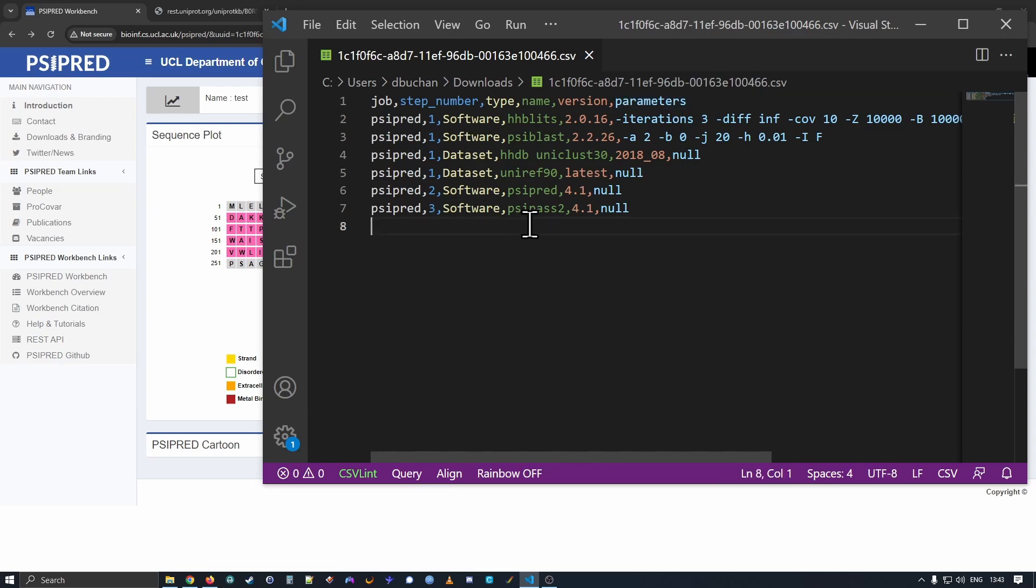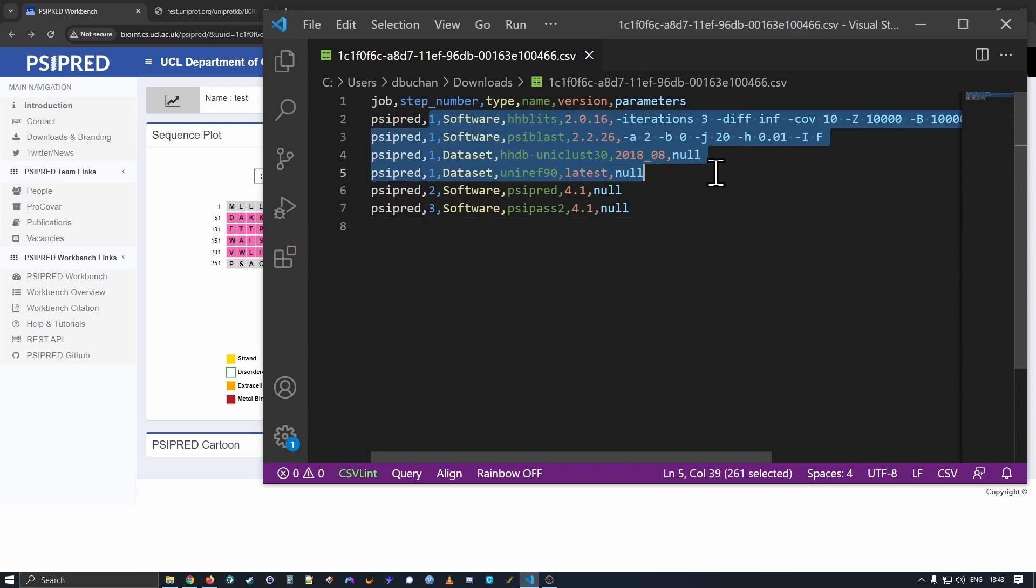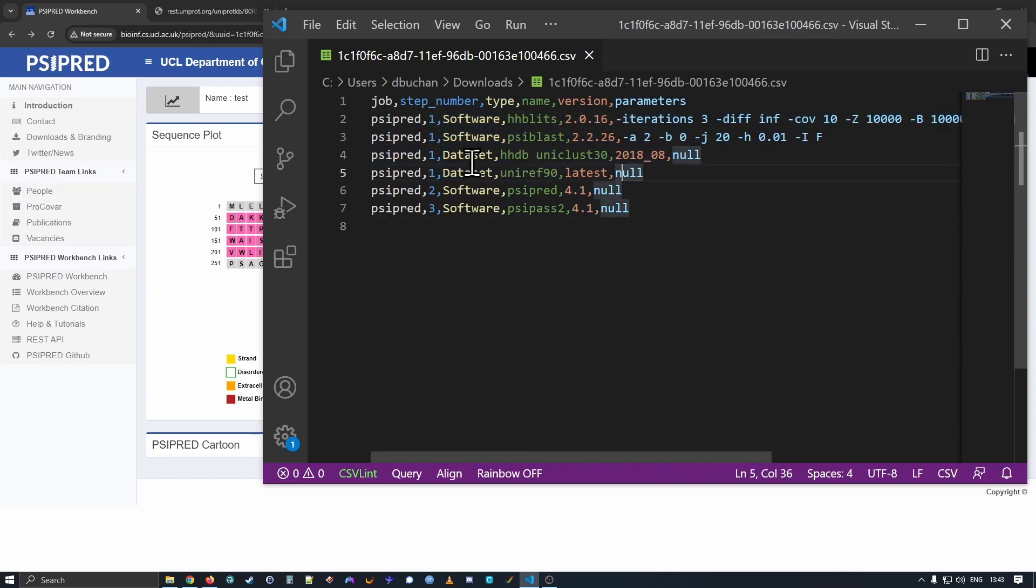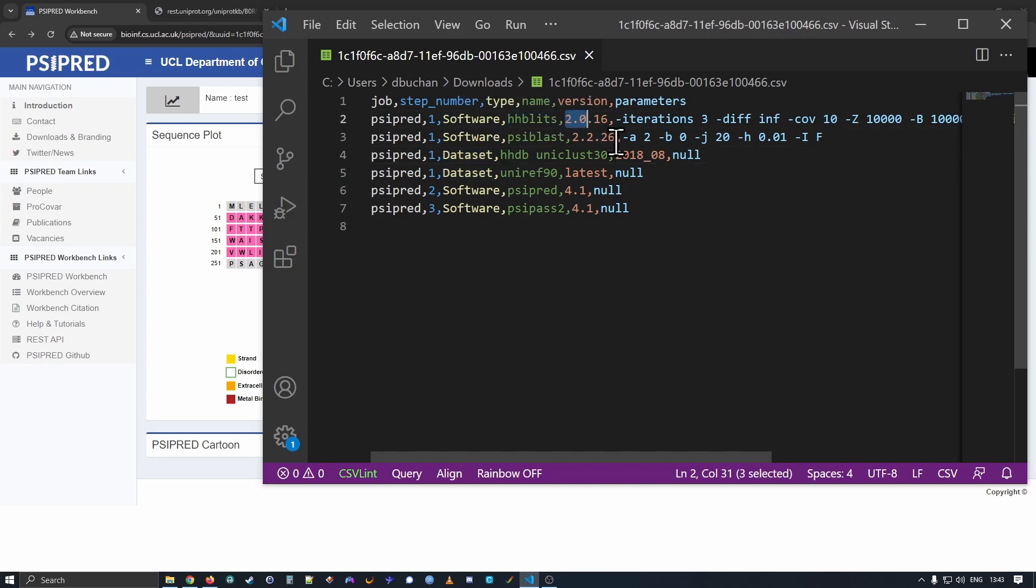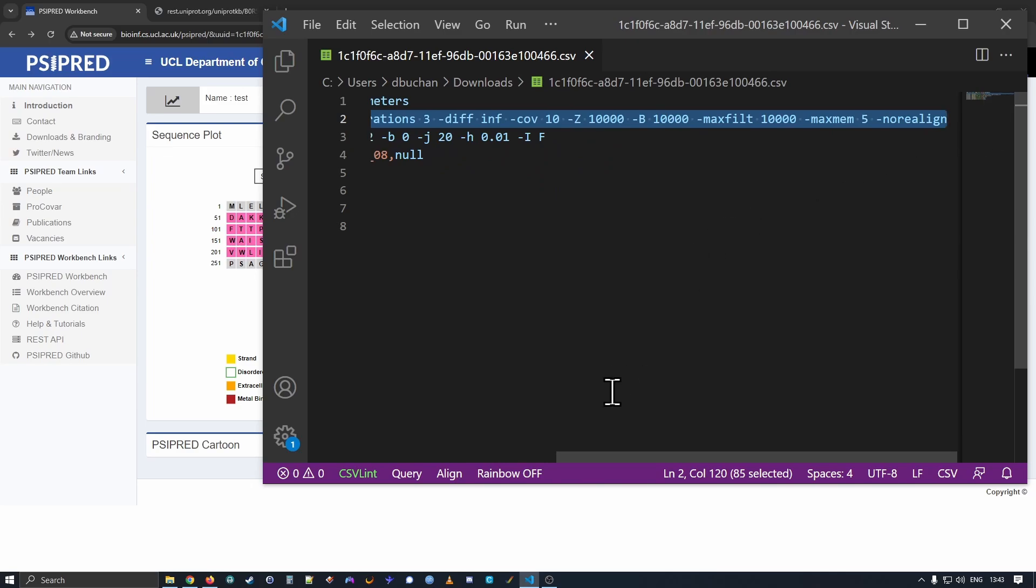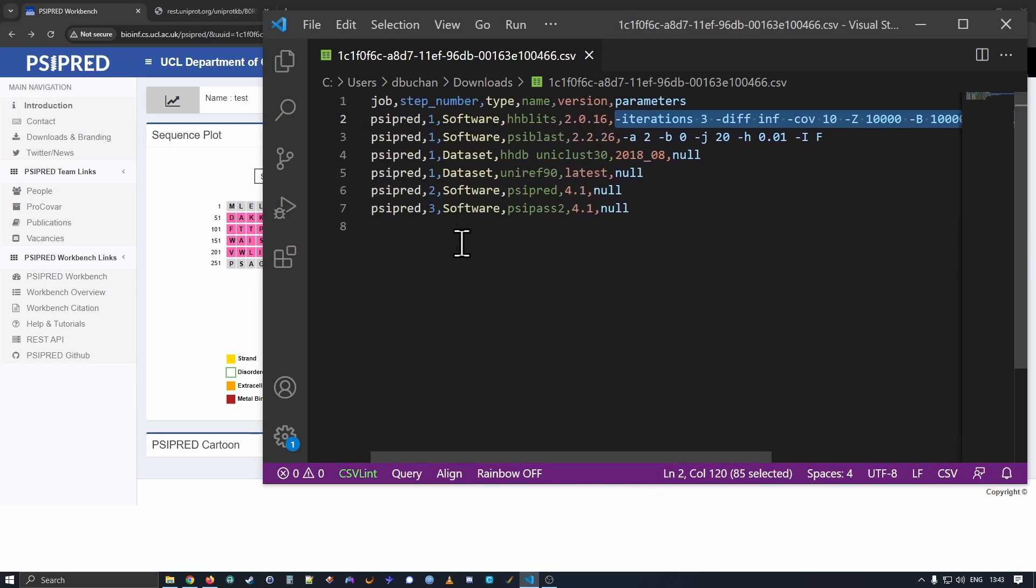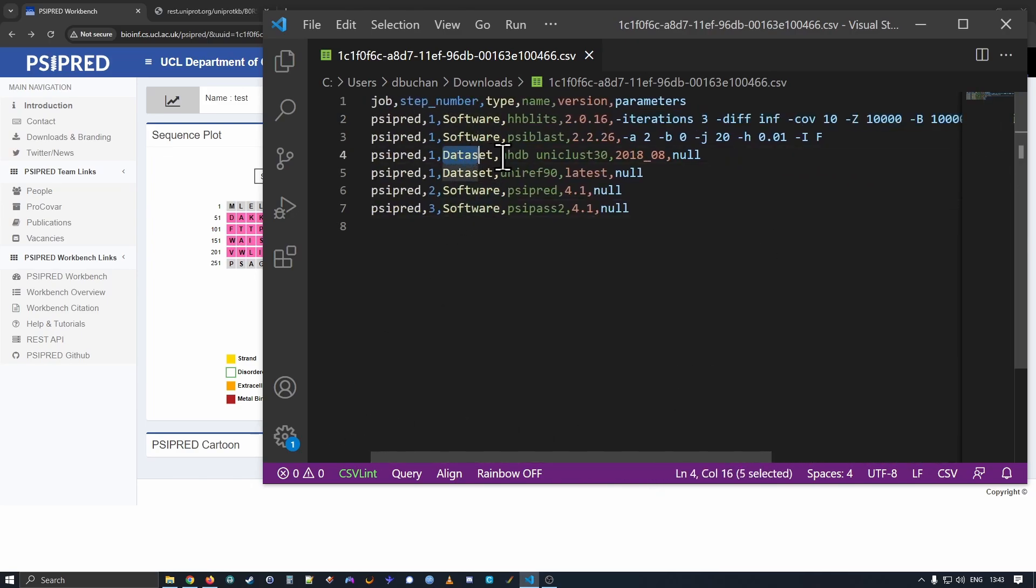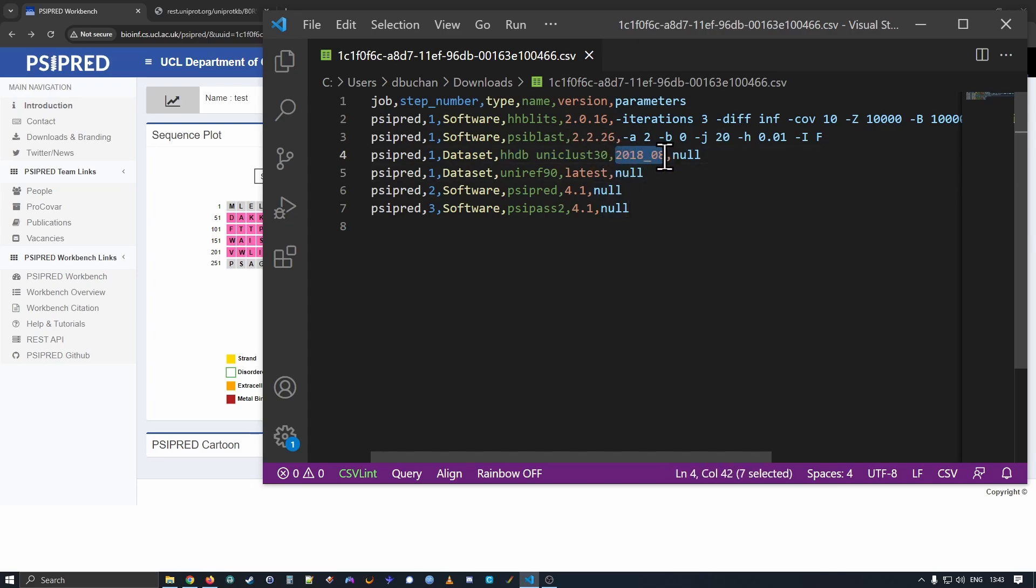So analyzing the PSIPRED job here, we can see the steps are numbered one to three. So there were three steps that were run. Step one consists of a couple of different pieces of software run on a couple of different datasets. So here we have HHblits version 2.0.16. And it was run with these HHblits parameters. We can look down on the dataset. We have the HH database for Uniclust30 released in August of 2018.